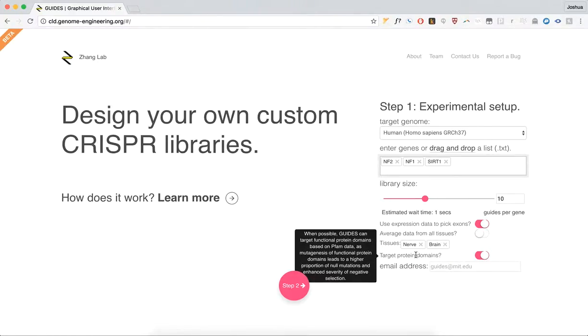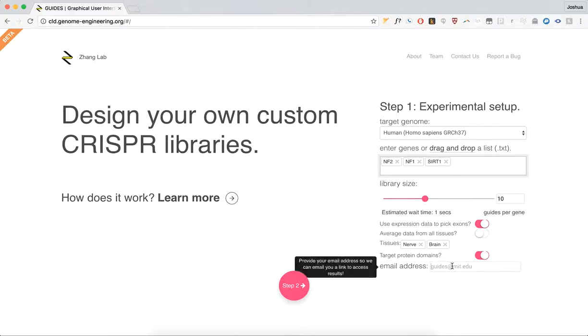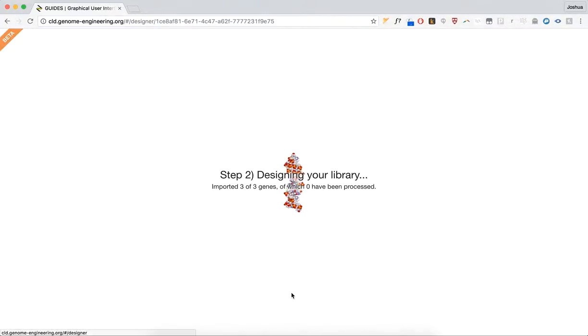You can choose whether to target protein domains, and then finally, enter your email address to move forward. Let's go to step two.